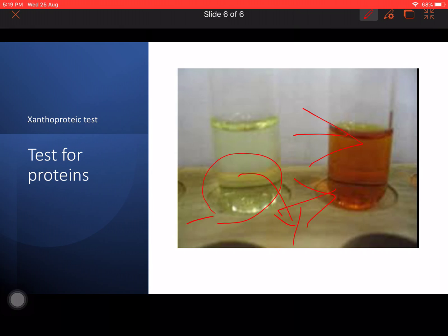And if we repeat the process with a piece of apple instead of peas, cheese, or hard boiled egg, will you get this color? No, never, because an apple piece is not a protein. You will find no yellow color on boiling the apple, and there is no question of making the solution basic again by adding ammonium hydroxide.